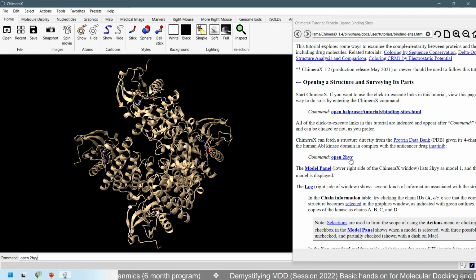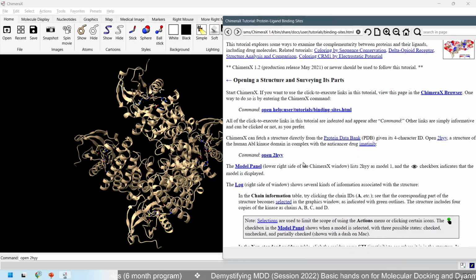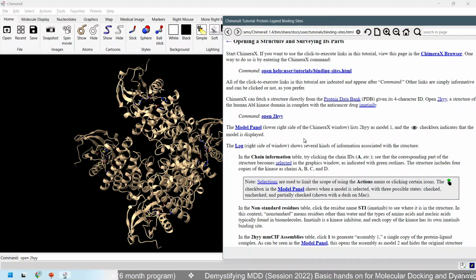So like that you can also create your own tutorial type of things or built-in commands and list them here or in some file and directly execute them to automate your process. That will be useful in saving your time and repeating the same thing for most of the projects.